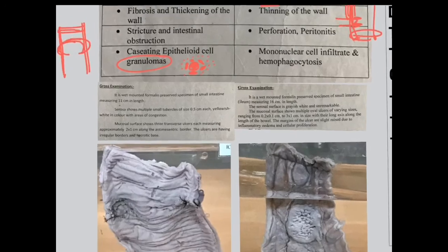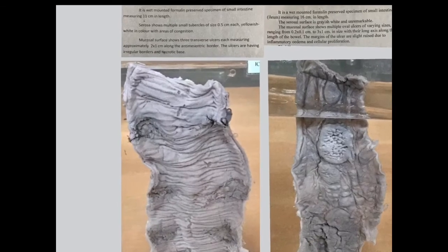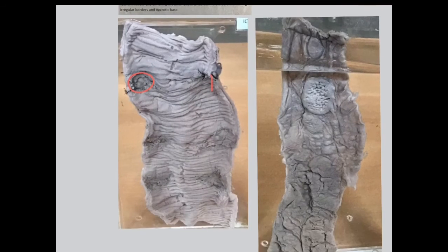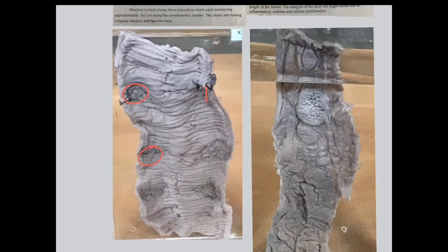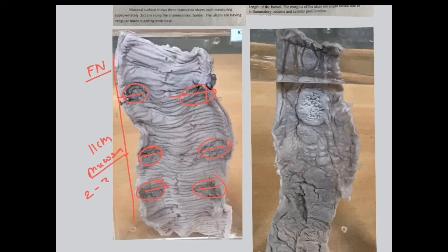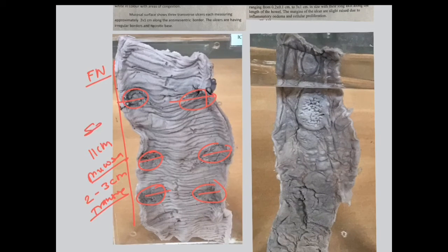Now coming to the main specimen. This is a formalin-preserved wet mount specimen of the small intestine measuring around 11 centimeters. Here you can see multiple ulcers of variable sizes, around two to three centimeters, which are all placed transversely. So this is the specimen of a tuberculosis ulcer. Description: formalin-preserved wet mount specimen of intestine measuring around 11 centimeters; on the mucosal surface, ulcers of variable sizes from two to three centimeters placed transversely are seen. On the serosal surface, the same specimen shows nodules, which is another feature of tuberculosis ulcer.